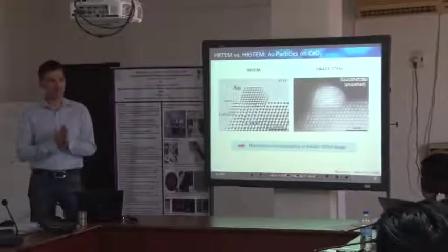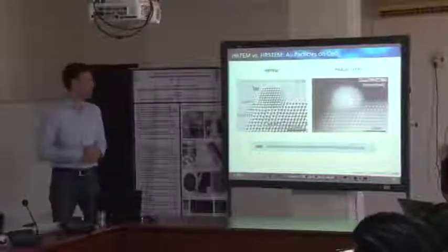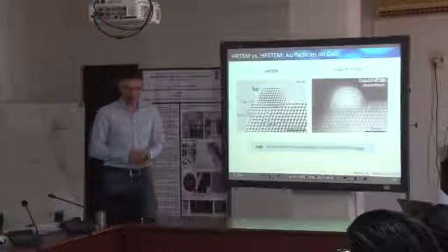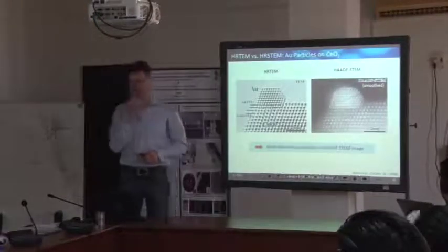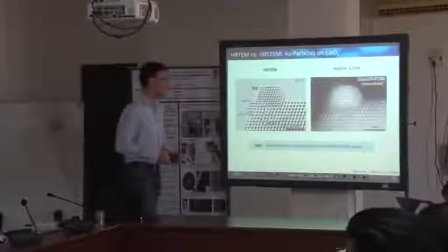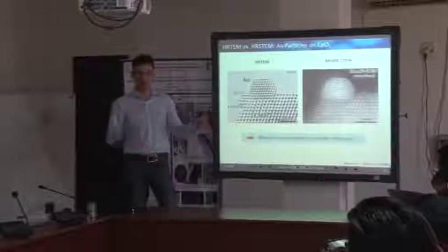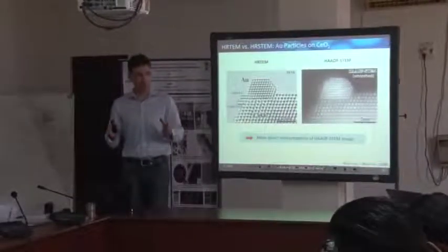This is one of our, like, not the last day, but one of our last days, and we're going to come to an end somehow. So today and tomorrow we're going to address some totally different topics. You already learned a lot about phase contrast and diffraction contrast imaging with a parallel beam on our sample.